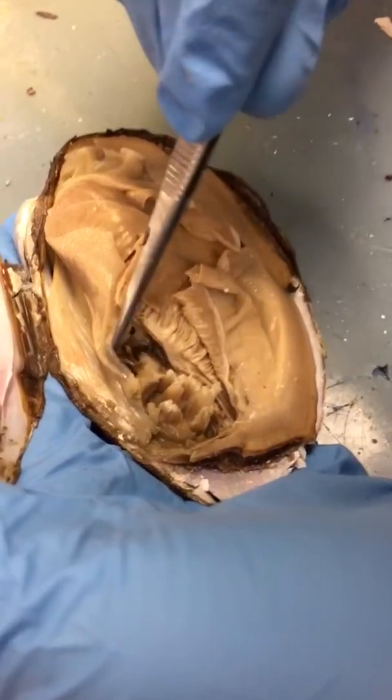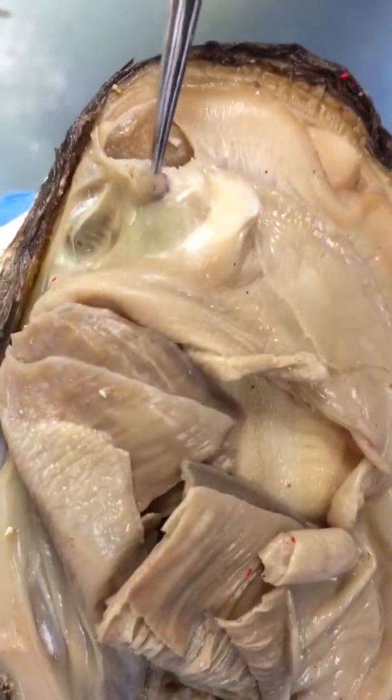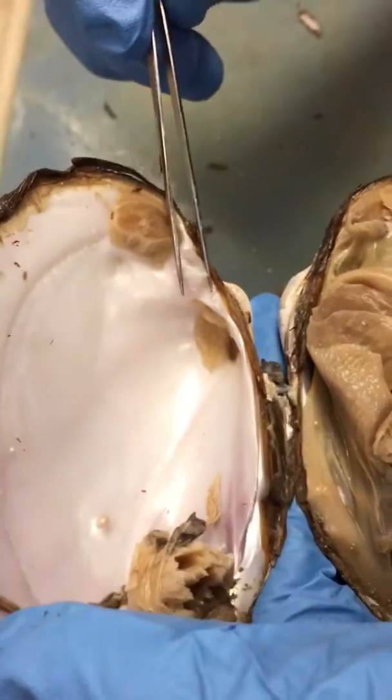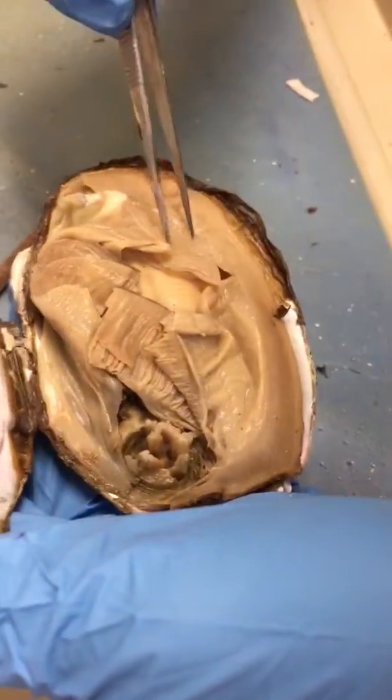The retractor muscles are the smaller ones — this is the posterior retractor muscle and anterior retractor muscle. Here's the pseudocardinal tooth. The mantle is the skin — there's the flap, yes, and here are the holes. This is the mantle.